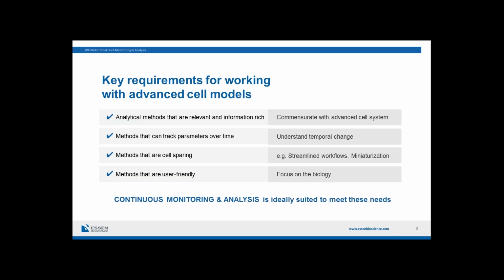And finally, you really want your analytical methods to be sufficiently user-friendly that you can use them to focus on the complexities in the biology rather than focusing on the complexities of the analytical method in its own right. So, with all that in mind, continuous monitoring and analysis as a method is ideally suited to meeting these needs presented by advanced cell models, and that will be the topic for the next section of this webinar.